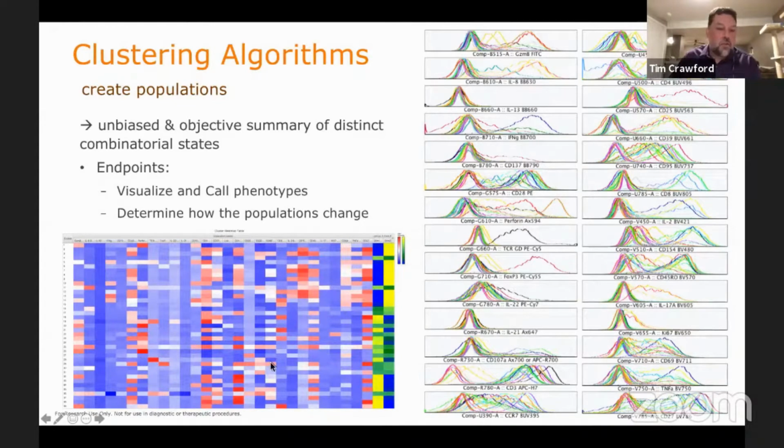As I mentioned, you can enumerate the median values of all of the markers for each population. You can also look at the traces and call phenotypes one at a time. It's kind of hard to see all the phenotypes when you overlay them all together when you've got 30 plus clusters coming out of one of these algorithms. But some resolve populations quite well. Gamma deltas and FOXP3 Tregs pop out as single populations here. But other expression profiles are going to be continuous and variable depending on the population. We see numerous clusters with intermediate or low levels of expression with CD95, CCR7, CD27.